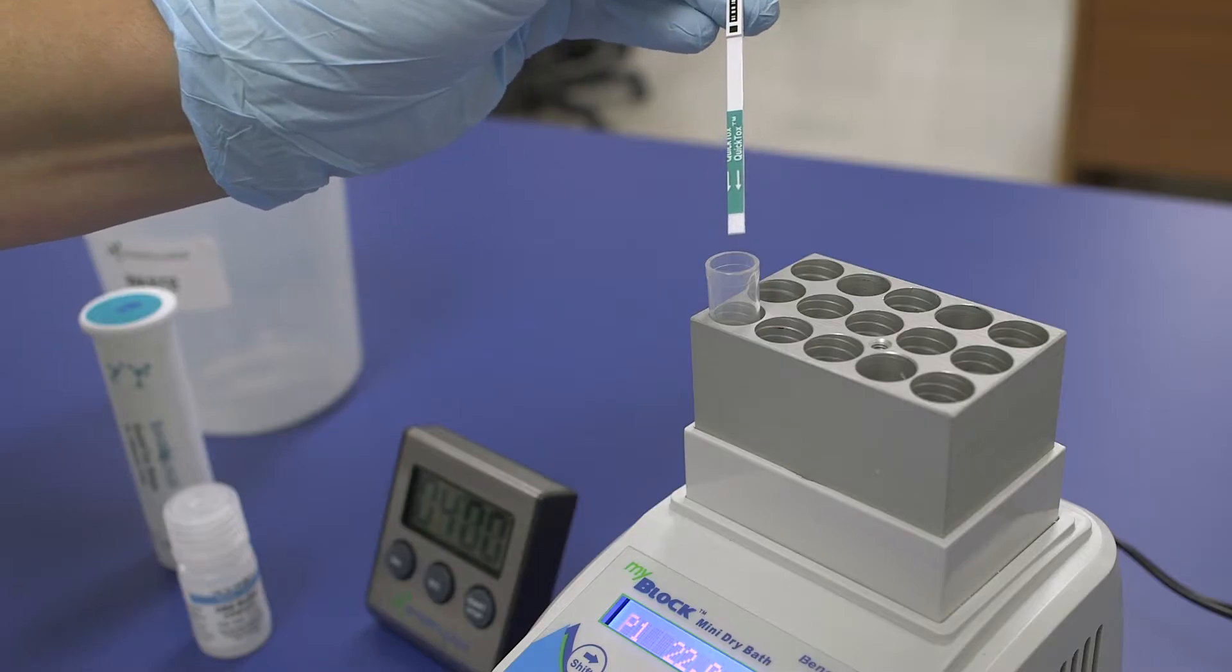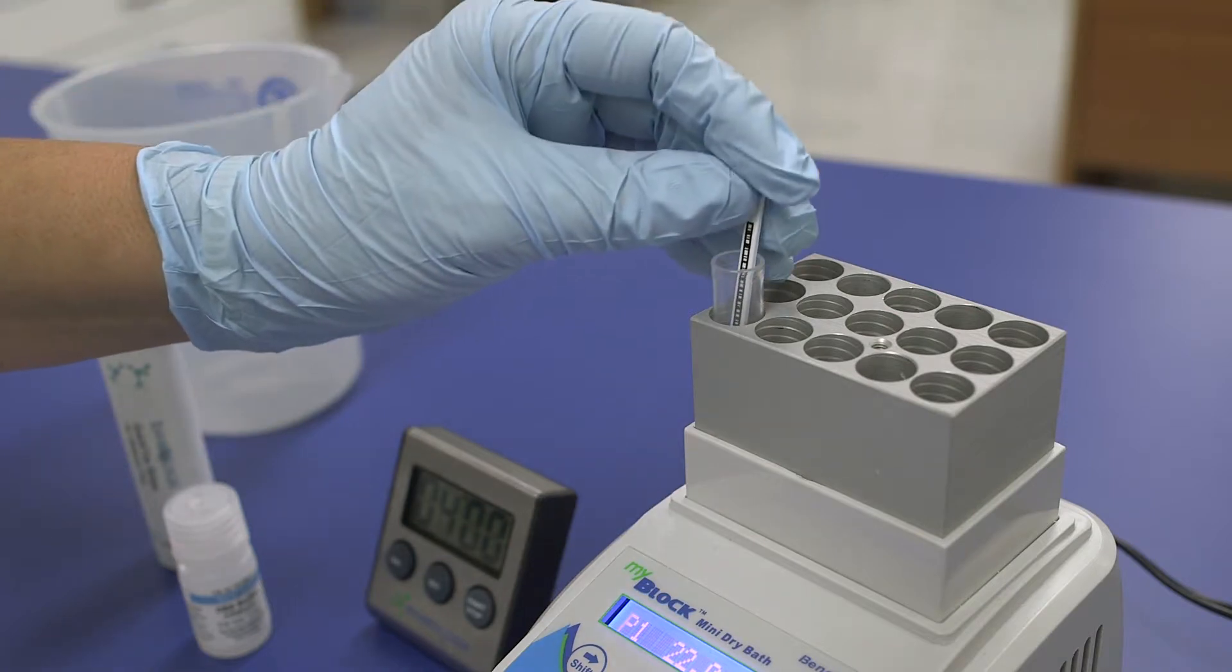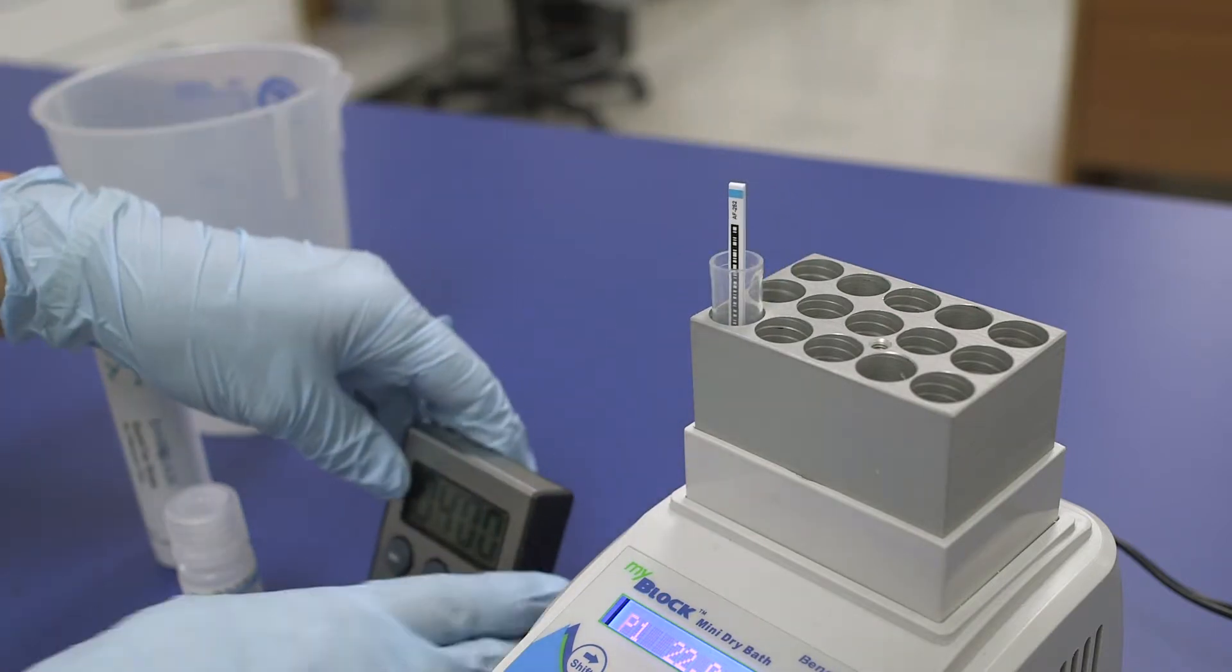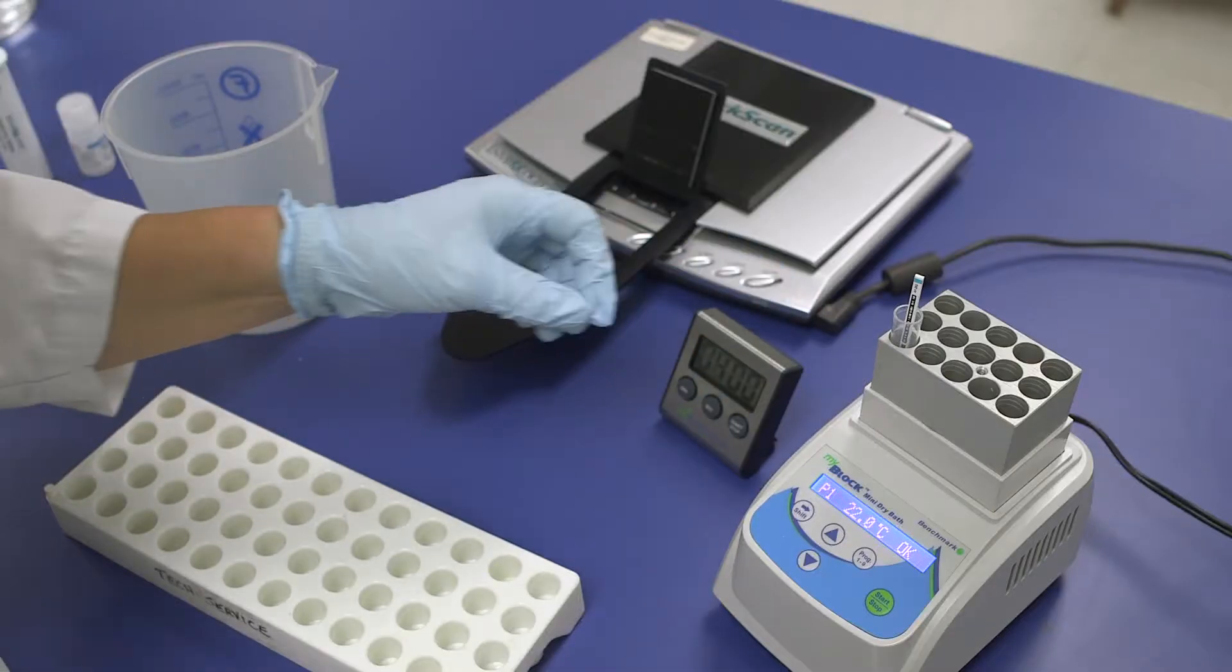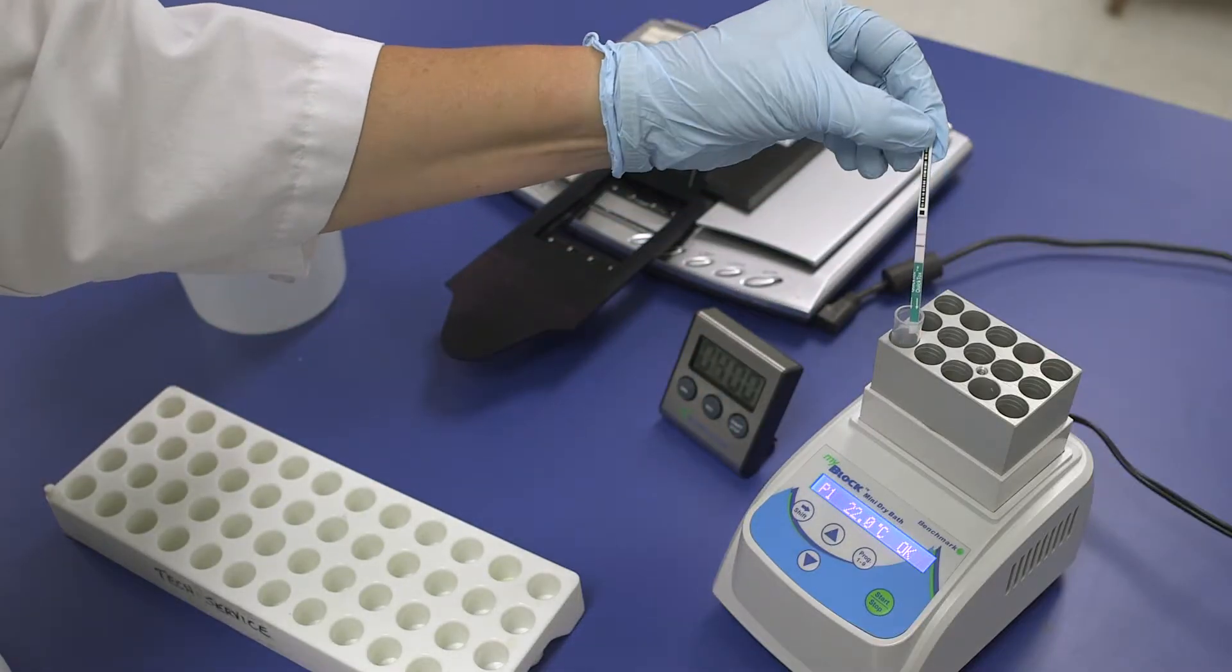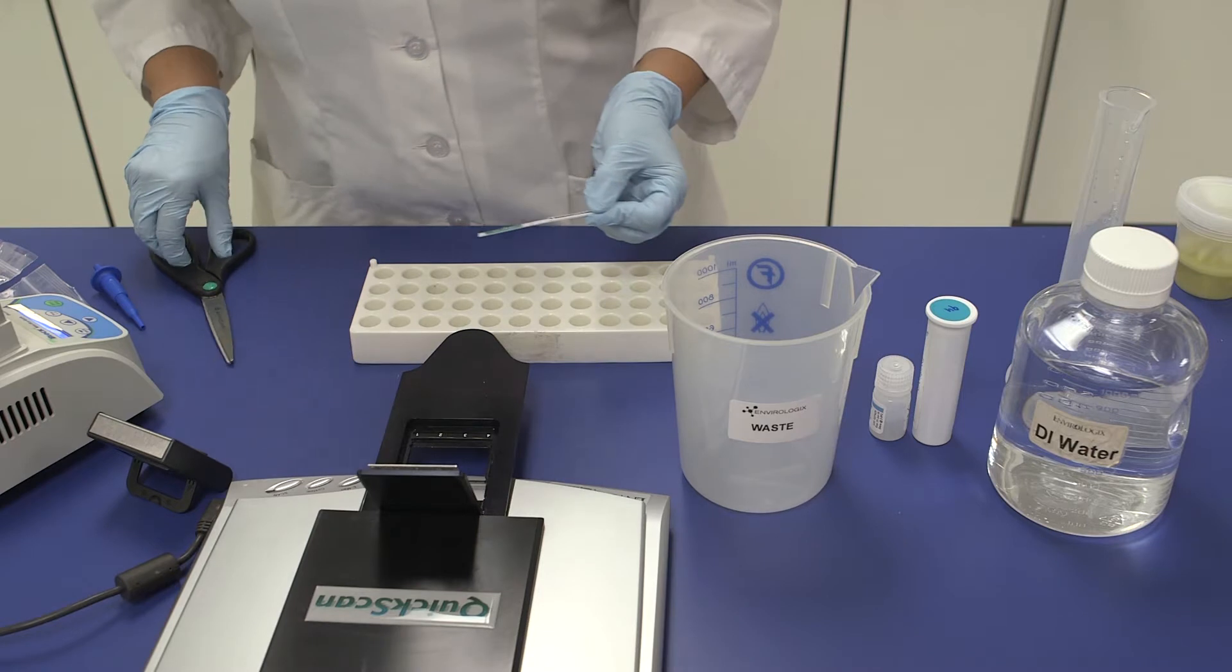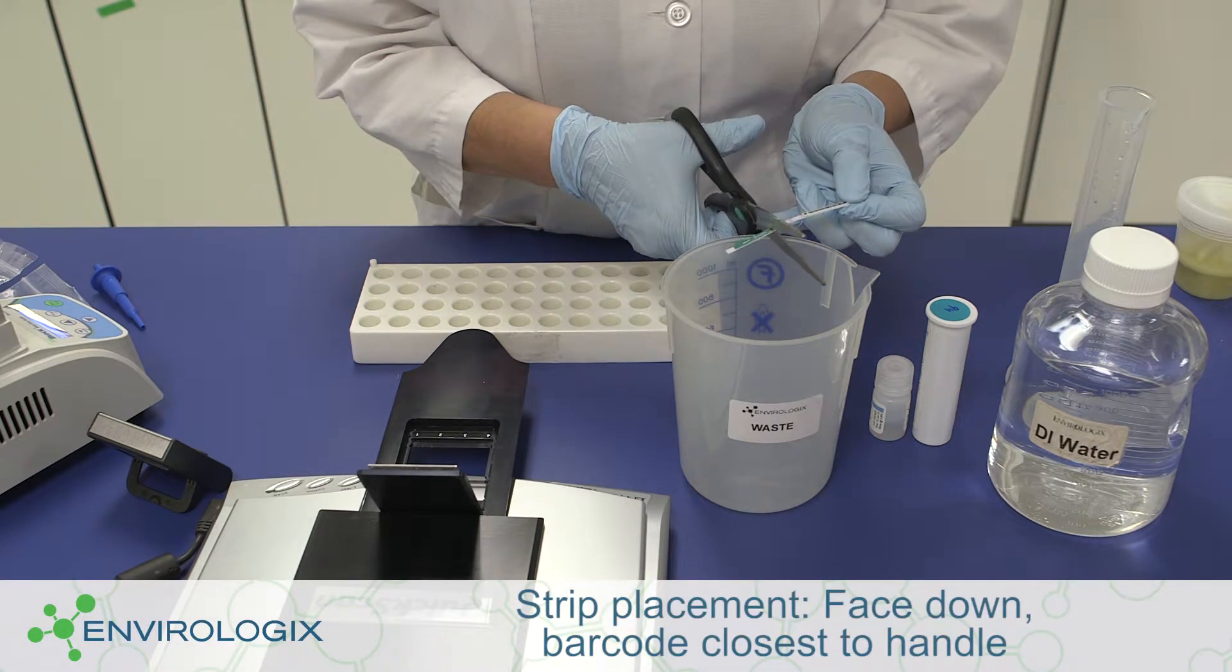Step 4. Add a new test strip and allow it to react for 4 minutes. Step 5. At exactly 4 minutes, remove the test strip from the tube. Cut off the tail pad and immediately place the strip in the quick scan reader.